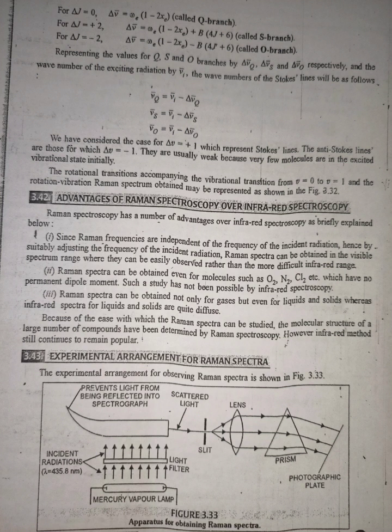Article 3.43: Experimental arrangement for Raman spectra. The experimental arrangement for observing Raman spectra is shown in figure 3.33. The fraction of light scattered is so low that normally only very weak Raman lines are observed. Hence, to detect the lines it is necessary to use a powerful source of incident light.